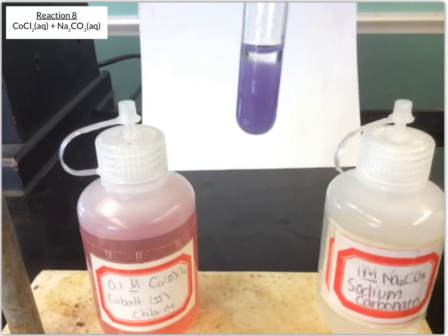Okay, so I've given it several minutes to separate. It's still not separated all the way, but you can see some of the solid at the top and then some of that purplish solid sinking down to the bottom. So some's trapped at the surface of the liquid, but the rest is settling. So we definitely had some sort of precipitation reaction occur.